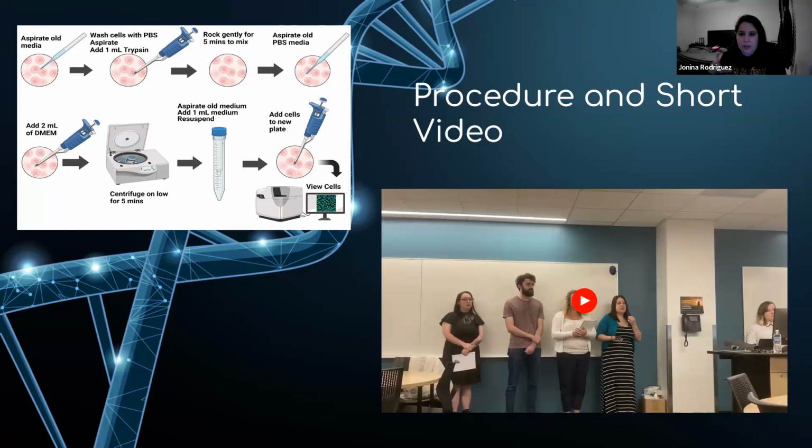So if you only have your tube, you want to make sure that you have another centrifuge tube that is the same weight, so it balances out the centrifuge. If not, it's not going to centrifuge correctly and it's going to be all wobbly. So it was really cool to see how that worked as well.